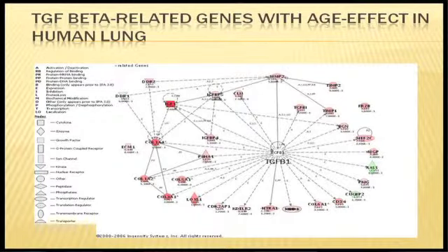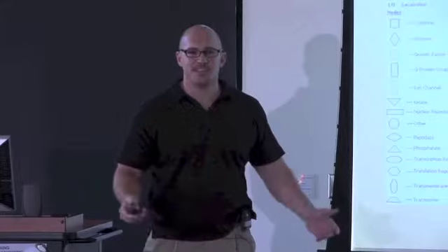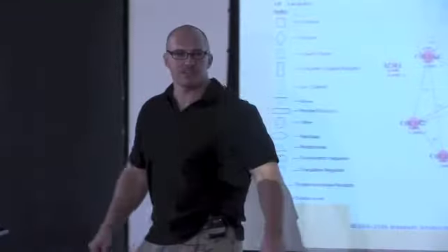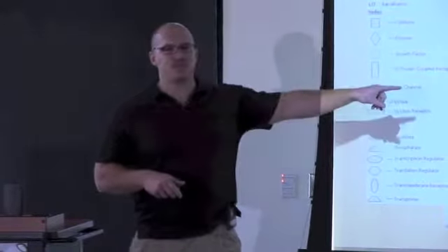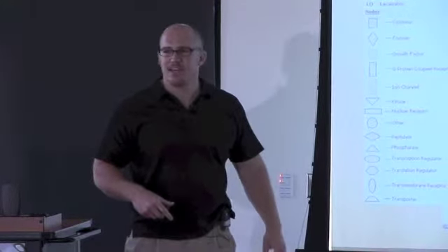So what would you expect? What would you say TGF-beta is doing in our system? Come on. Upregulated, increased activity. Even though in my list I'm not seeing a change in that expression, I see its footprint, right? I don't see the stone, but I can use the waves to get back to that stone. Does that make sense? And that happens a lot.